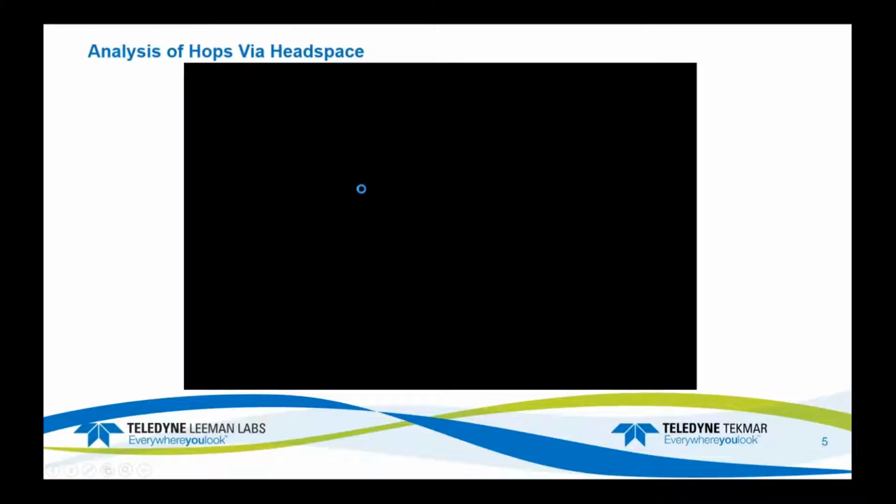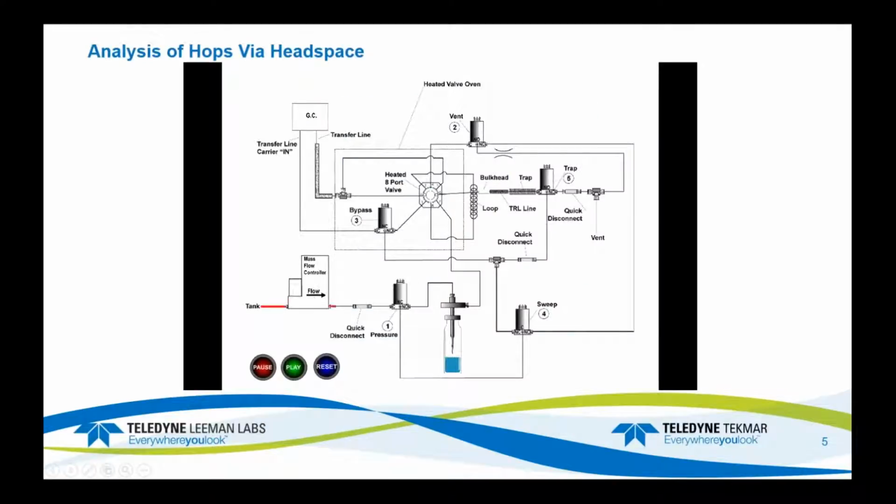Here we see a video of the basic headspace technique, although it looks like this video may not be coming up. So I'm going to apologize for some difficulties. Hopefully that's all corrected. What we see here is pressurization of the sample. So we let the sample come to its temperature equilibration, and then we're going to pressurize that sample so that we can extract that headspace.